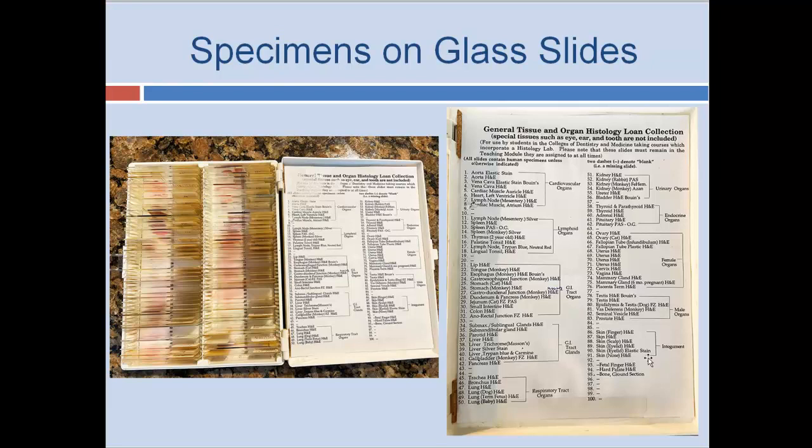But these are the glass slides that you saw earlier in this talk, and how they were prepared. And this is the slide collection that was shared and loaned to one of two students. Used to be that every student got their own slide box, and in the distant past, they had 3 boxes of slides to look at and study and learn and be tested on.